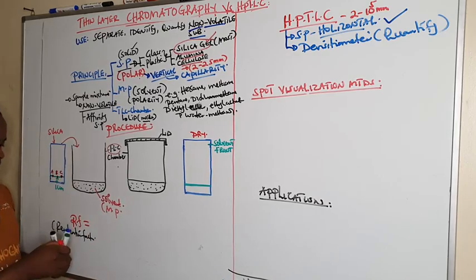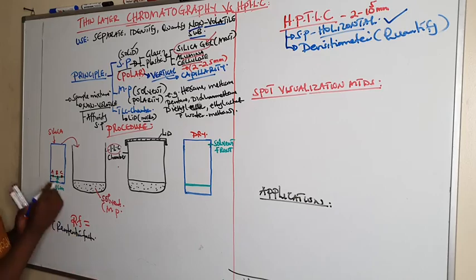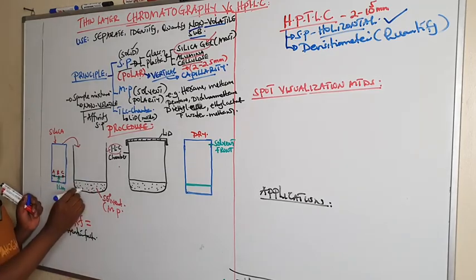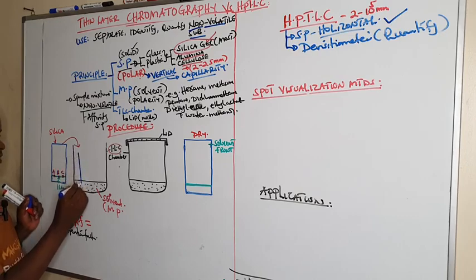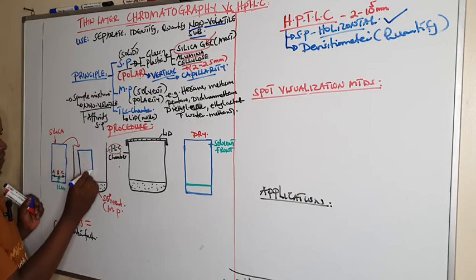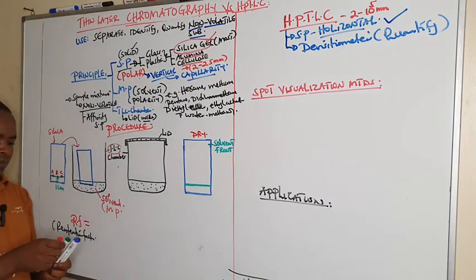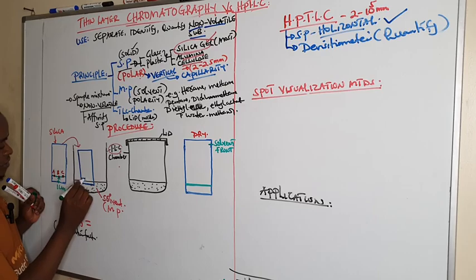After placing it, we make sure the line of application is at least 0.5 centimeter above the solvent.